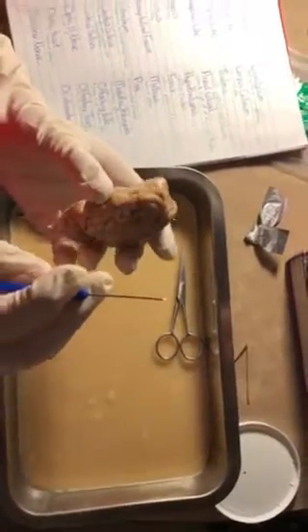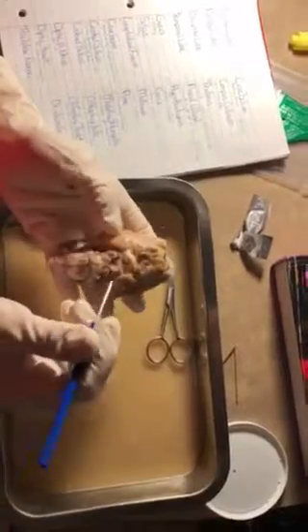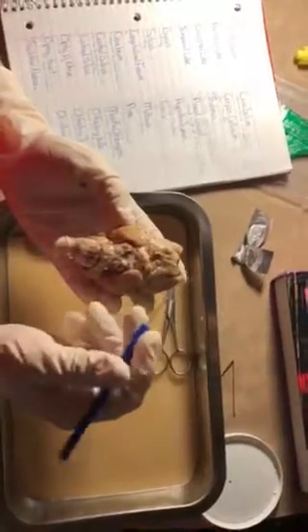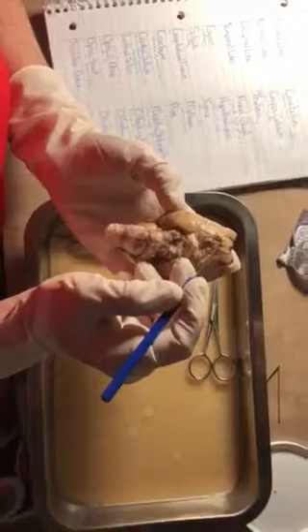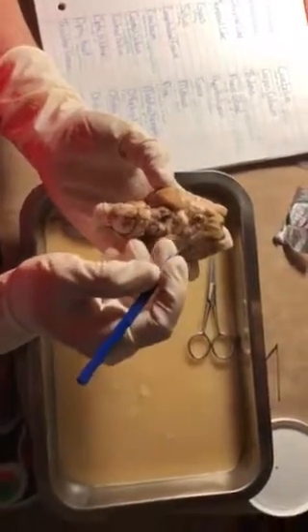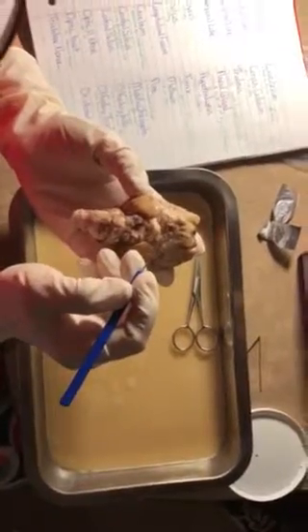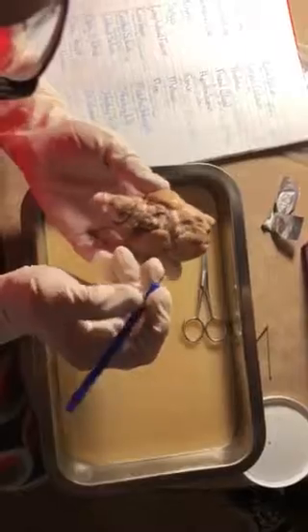We're going to next flip over the brain and look at some of the structures here on the ventral view. Right here is where the olfactory bulb would be, which would connect to the olfactory tract that would run down the cerebral hemispheres.